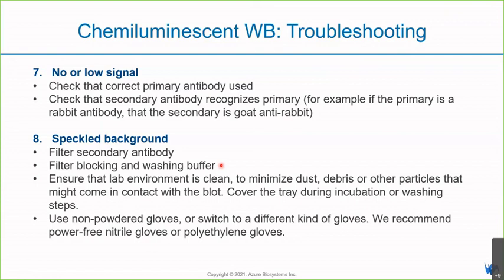Right. So if you have done all these things and you still see the speckled background, ensure that your lab environment is clean, and minimize the dust and debris or other particles that may come in contact with your blot. It might be on your table, it might be in the air. Try to cover the tray during incubation or washing steps to avoid any unnecessary contact with these particles.